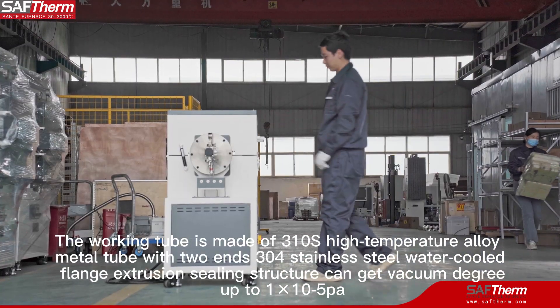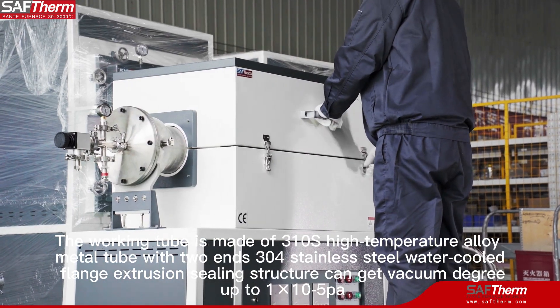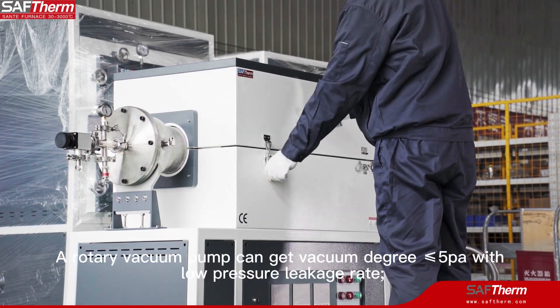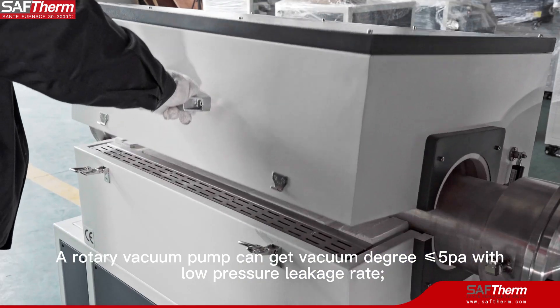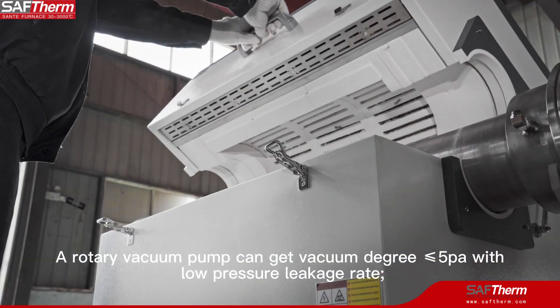The sealing structure can achieve a vacuum degree up to 1×10⁻⁵ Pa. A rotary vane vacuum pump can achieve a vacuum degree less than or equal to 5 Pa, with a low pressure leakage rate.